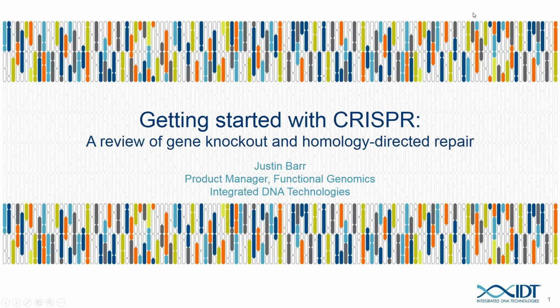I'm excited to be talking about how to get started with CRISPR. We'll be reviewing gene knockout and a little bit about homology-directed repair as well. My goal for this webinar is to provide what I hope to be an easy introduction to designing your guide RNA for CRISPR, and then also to give you some sense of what you might need if you want to jump straight into homology-directed repair.